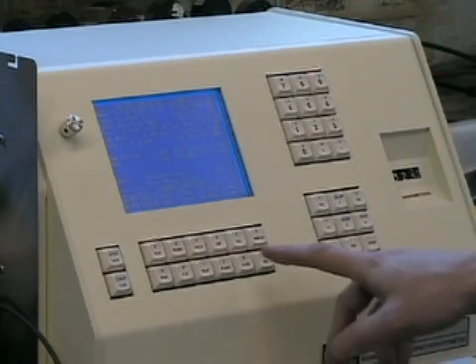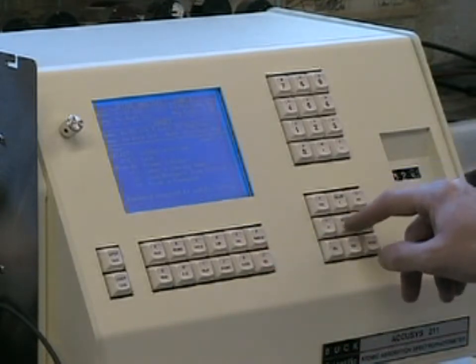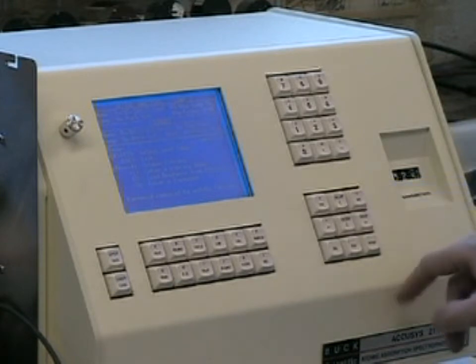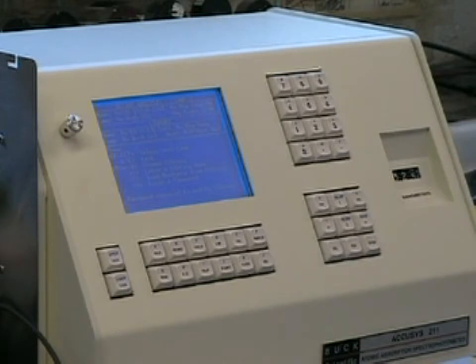We will do some analysis of barium for our nitrous oxide demonstration, and the barium lamp is inserted in lamp 2. So again, by pressing the library key, the select key to select lamp 2, and then the up-down arrows to select the barium absorption line. You press 2 and enter to load that file into the lamp 2 position, and then press the escape key, following the directions that we did before, setting the slit and wavelength so that we may maximize the energy of the hollow cathode lamp.